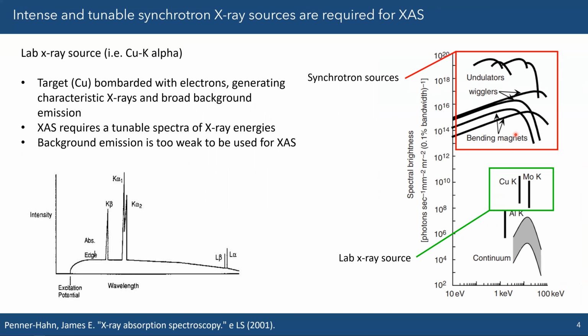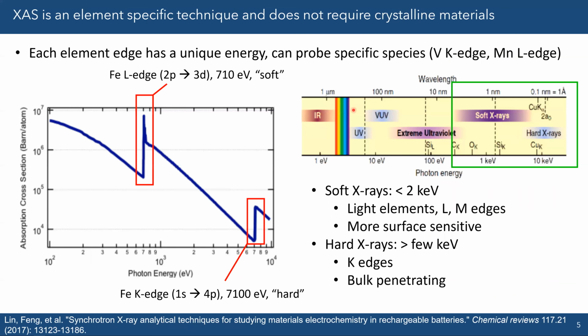So when you go to the sites, you'll see a beamline registry where it lists each beamline. Besides XAS, there's a bunch of other X-ray techniques, but look at the XAS beamlines and their specifications: what energy range can it run to? You have to make sure that it'll match whatever edge you want to do. ALS only really does soft XAS, so you can't do hard XAS there.